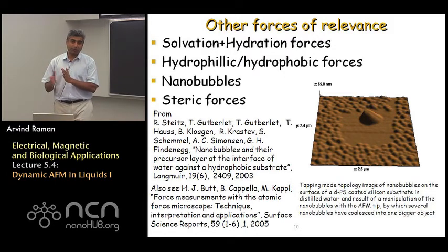There are a bunch of other forces which we have not talked about so far. Probably the most important one of them is the hydration force. The hydration force refers to the force, which is a very short-range force, typically happens in about a nanometer or two between the tip and the sample. The DLVO forces were all based on an understanding of continuum electrostatics, but when you come to such small spacings, you cannot deal with water as a continuum. You have to worry about it as a layered medium of molecules, layered molecules of water.